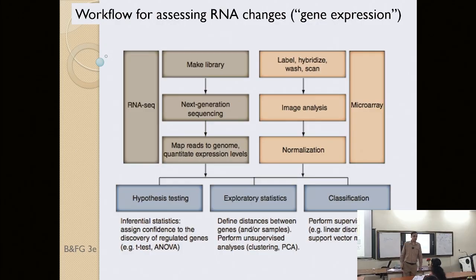Okay, and you may also want to perform exploratory statistics. So perform clustering analysis. For example, principal component analysis of the samples. So 3 samples from me and 3 from healthy individuals. Okay, so perform PCA. You would expect that my samples will group together and show as a group in the PCA plot. And those from healthy individuals will group together, far from me. Okay, so you'd expect that.